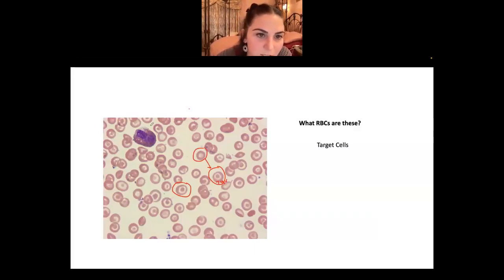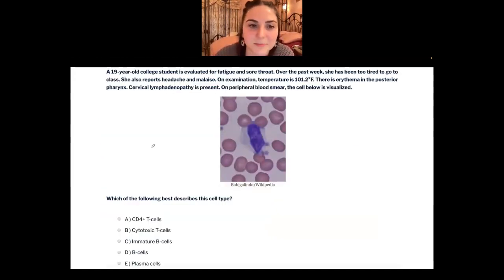Good question. I would say this would be an eosinophil maybe. I don't know, this is hard. The pink granules are big. I would probably see if this patient had more eosinophils throughout the peripheral blood smear before definitely calling this an eosinophil. But the granules are really big and this is relatively pink, so I would probably call that an eosinophil. Okay, next.